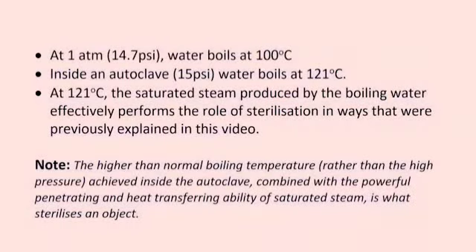Water boils at 100 degrees Celsius under normal atmospheric air pressure. However, when the same water is exposed to a pressurized environment, according to the principle of gas laws, the boiling temperature of water also increases accordingly. At a pressure of 15 pounds per square inch, which is the usual pressure found inside an autoclave, water present in the autoclave is capable of achieving a boiling temperature of 121 degrees Celsius.